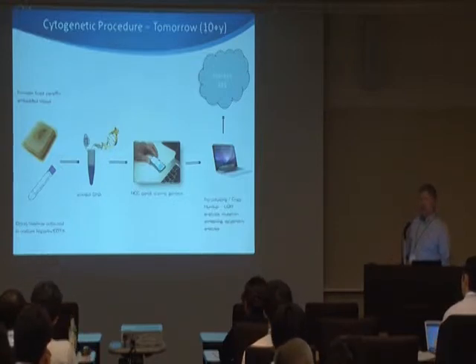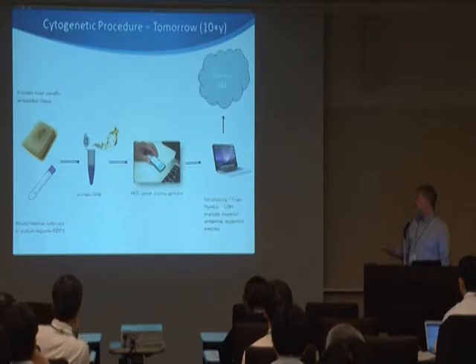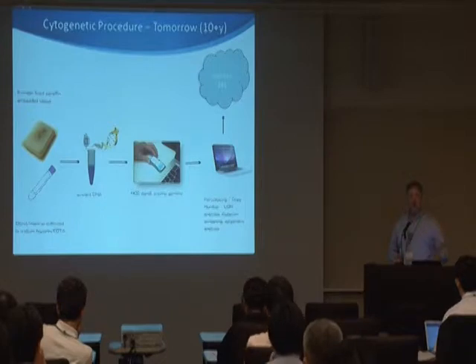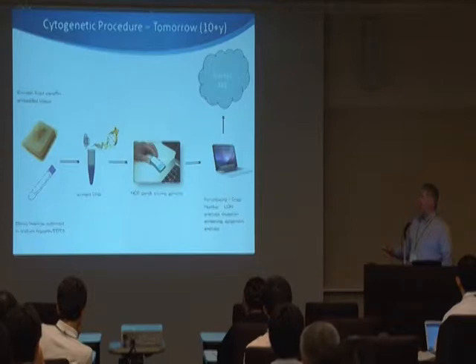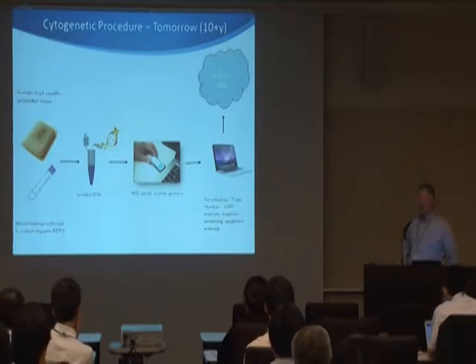I don't know if you've all seen this device that was prototyped at the AGBT meeting in Florida a few years ago, and it's a prototype of a next generation sequencer that would plug in to the side of your computer like a USB drive, and you would simply drop a small sample inside, and it would provide massively parallel sequencing for you. My understanding is this was a disposable unit, so it was about $1,000 US was the idea, and then you would just throw it away. So I don't know if that's cost effective or not, but it's certainly a very interesting idea.